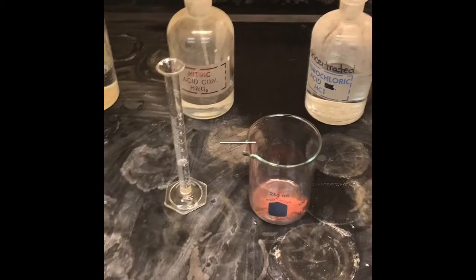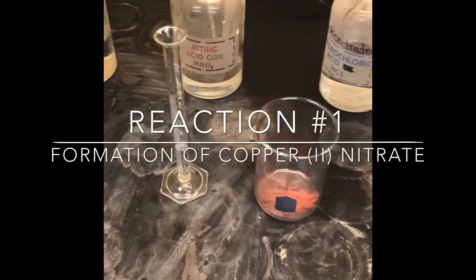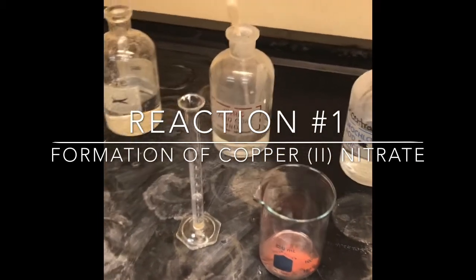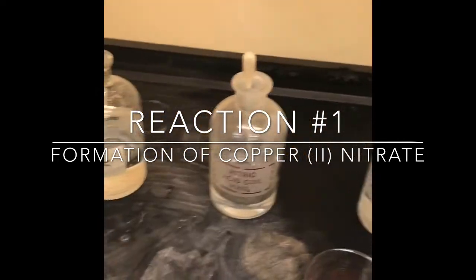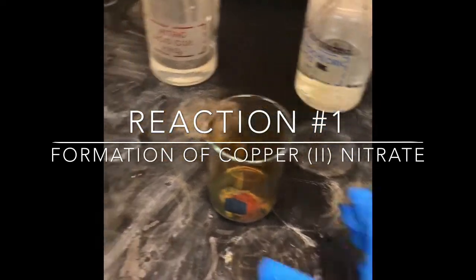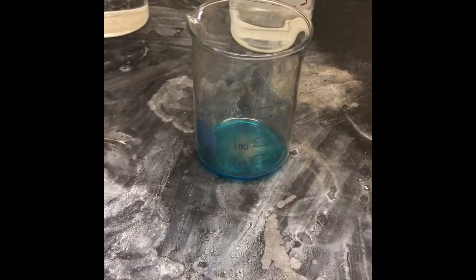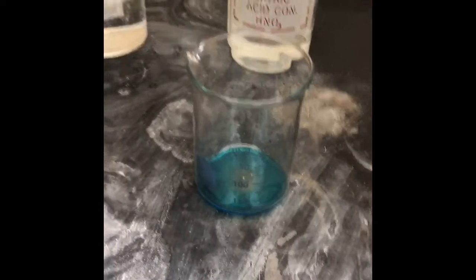Okay, so the next portion of the lab says that we're going to add 4 milliliters of nitric acid to our copper. As you watch this, you're going to see a brown gas evolved. I'm going to add it all at once. And so we continue this until all the brown gas has evolved. Once the brown gas has stopped evolving, we're going to add 125 milliliters of distilled water.